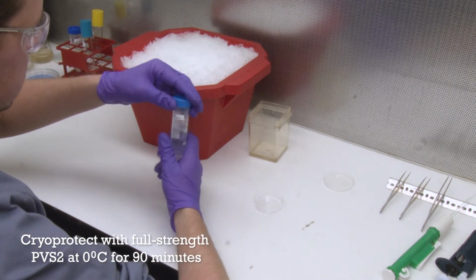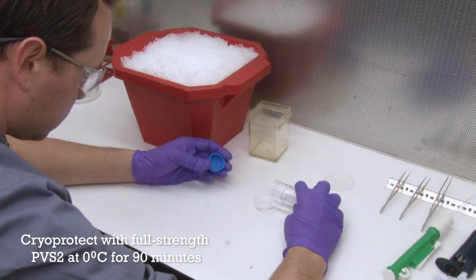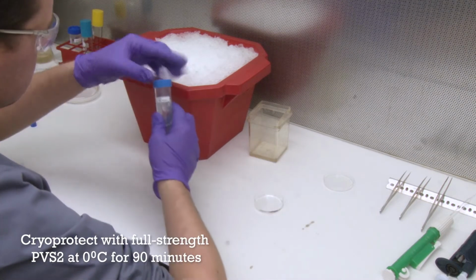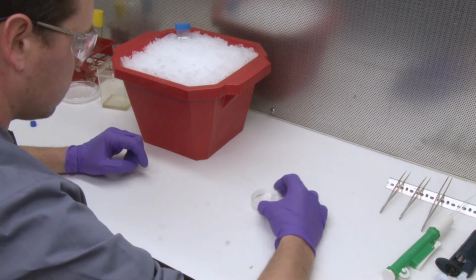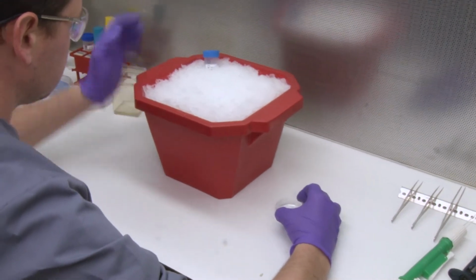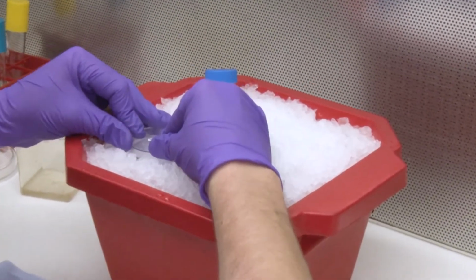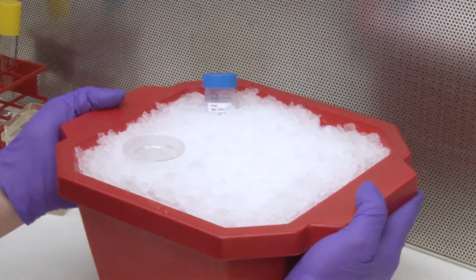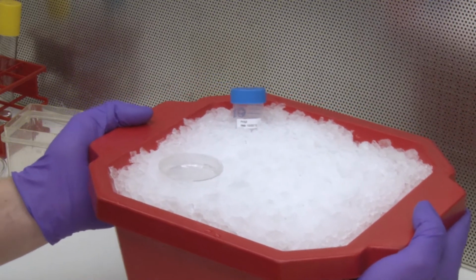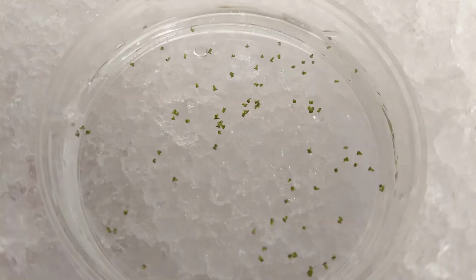Now we're going to add the ice cold PVS2 full strength to the shoot tips. And then we'll give it a little stir, and we are going to move the dish into the ice. Crushed or flaked ice works best for this. If you can gently embed the plate into the ice and secure it, then you can gently stir the container. There you can see all the shoot tips floating in PVS2.